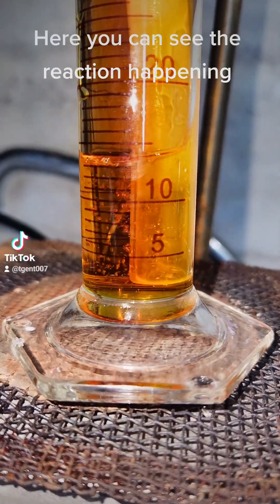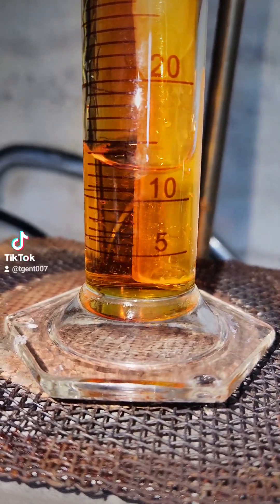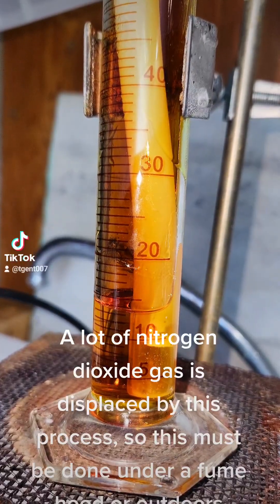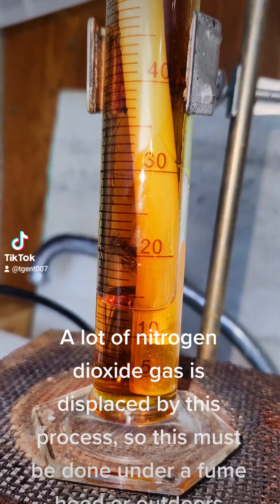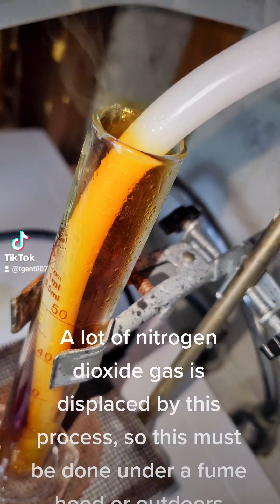Here you can see the reaction happening. A lot of nitrogen dioxide gas is displaced by this process, so this must be done under a fume hood or outdoors.